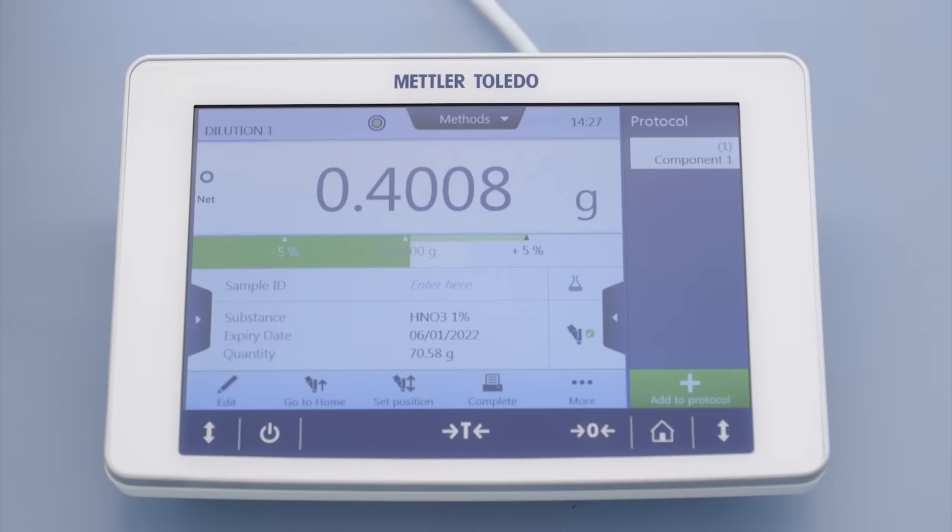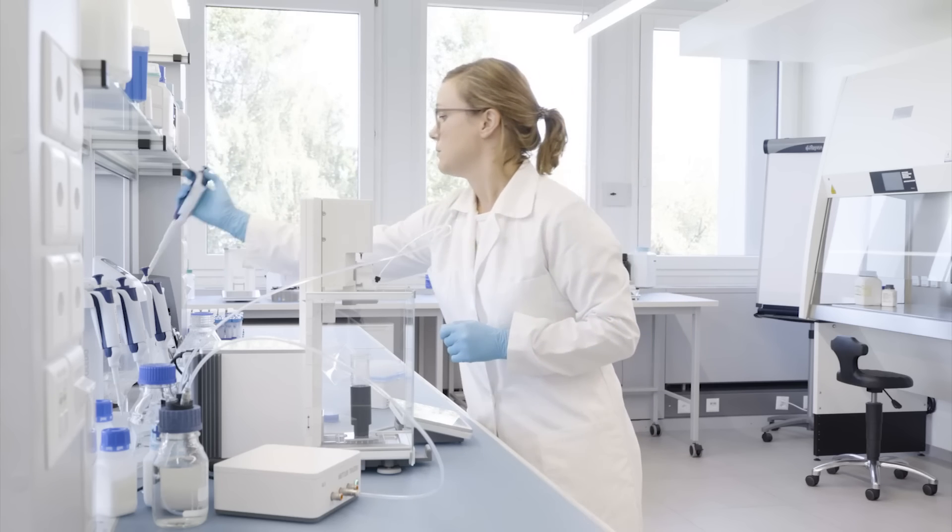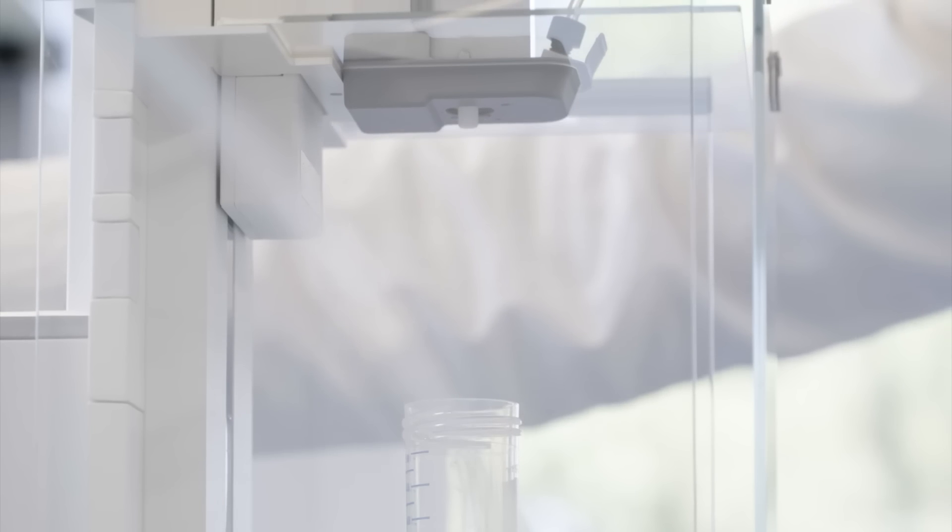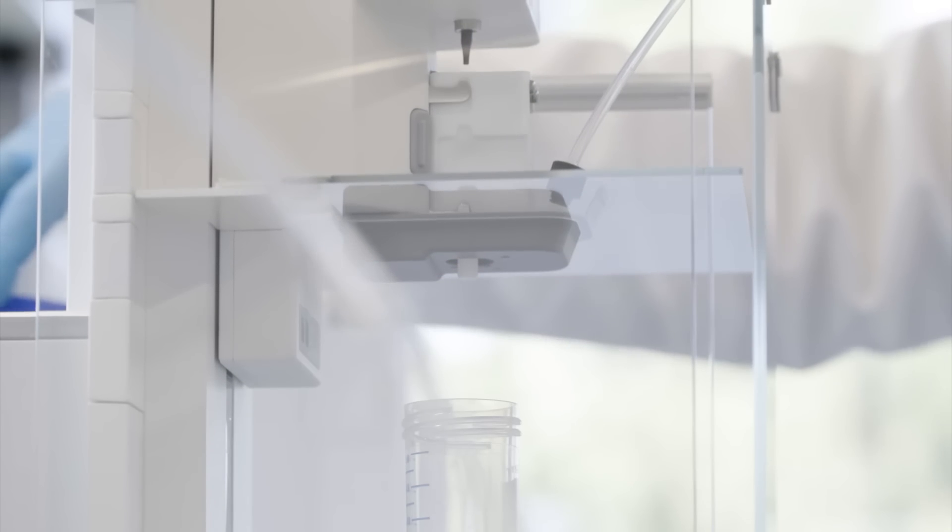The XPR Automatic Balance automatically calculates the precise amount of solvent needed to achieve the target concentration and dispenses the liquid directly into your container, while you can use this time to perform other tasks.